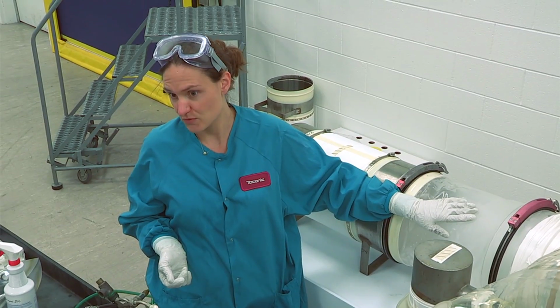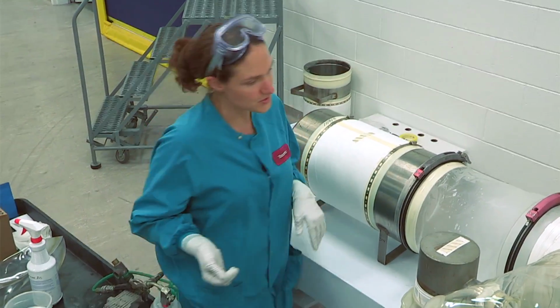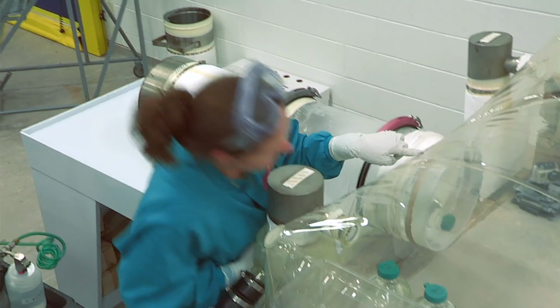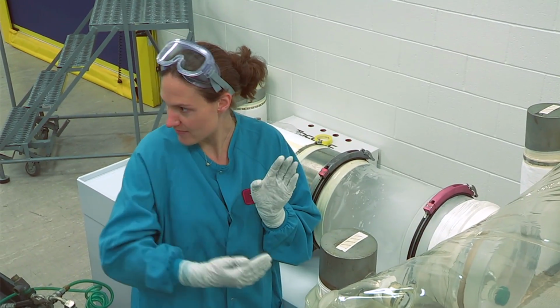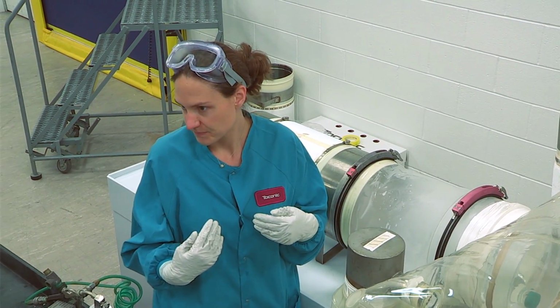We use a 20-minute wait time for our sterilant. And so within that 20 minutes, if there's a hole, you'll know, because right now we have a nice little protruding bubble on the cap, and if there is a hole, that will be sunken in.